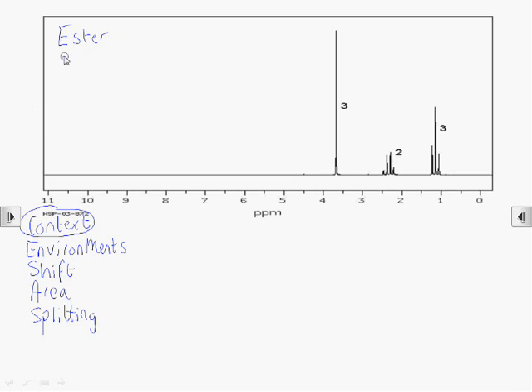We know this is proton NMR because the chemical shift scale runs from 1 to 11 parts per million. It would be 1 to a couple of hundred parts per million if it was carbon-13 NMR. And lastly, no D2O, so all the hydrogens will be producing NMR signals, even the OH and NH, which would otherwise exchange with D2O. Those signals would otherwise disappear if there was D2O present.